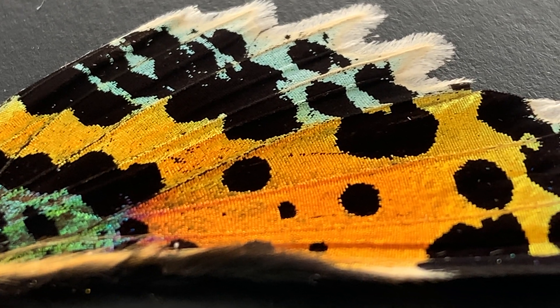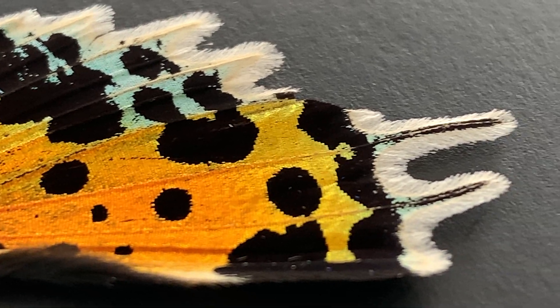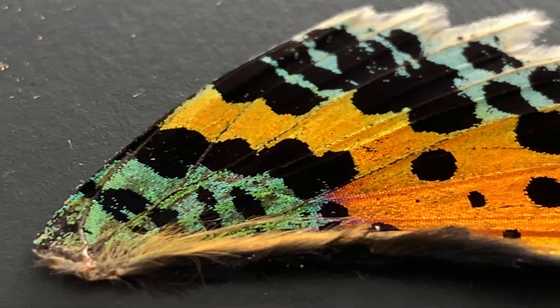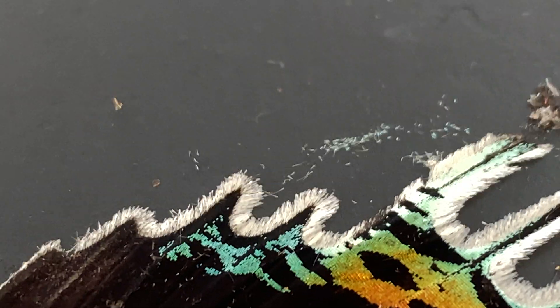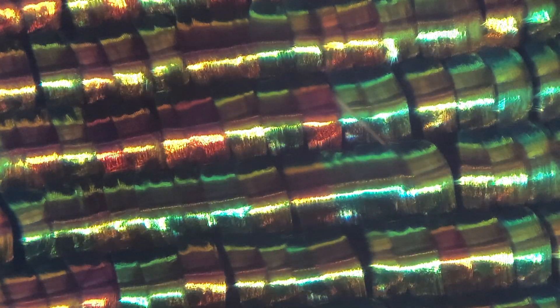So this next one I'm showing you here isn't actually a butterfly wing — this is a moth wing. I know what you guys are thinking: most moths are kind of brown or white or black, but moth wings can actually be just as pretty as butterfly wings. They are in the same family. You can kind of see here a couple of the scales had fallen off — these things were super delicate to handle. But yeah, let's take a look under the microscope.